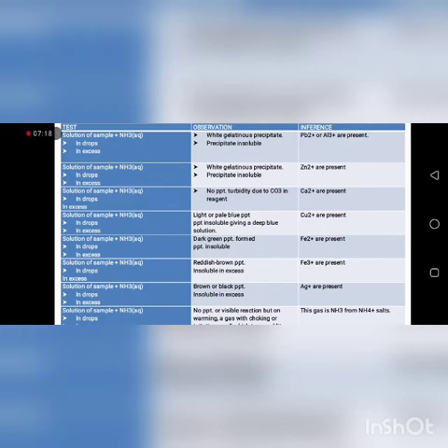Aqueous ammonia is added to the unknown sample in drops and excess, light blue. When you see a light blue or blue precipitate, and the precipitate is soluble, giving a deep blue solution, that confirms that copper 2+ ions are present.